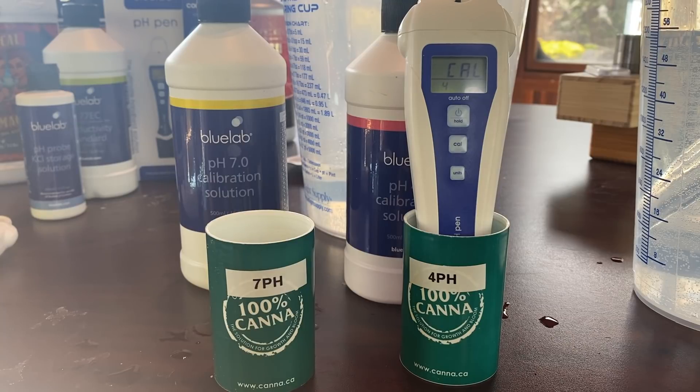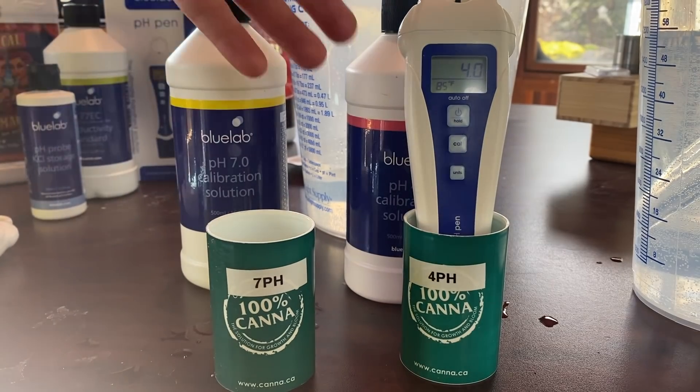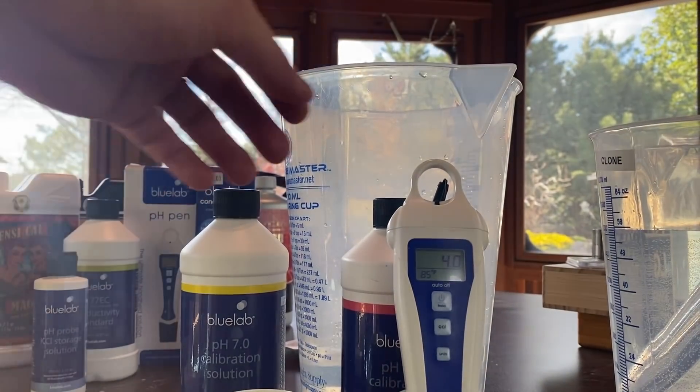Awesome, and that's that guys — that's how you calibrate the pH level of the Bluelab pH pen. Now that that's over, we're gonna go ahead and rinse the tip off.